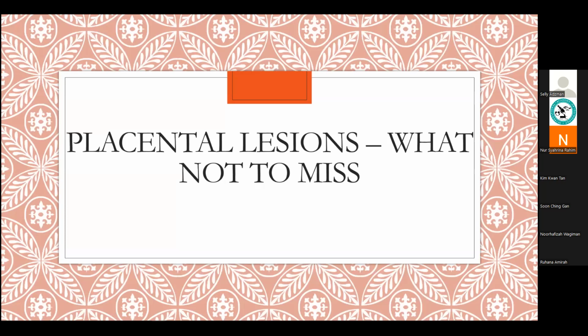I'm aware that not all hospitals practice sending all the placentas. So basically, what I'm presenting is probably the ideal practice in dealing with placental specimens. However, I will try to incorporate what we used to practice daily in Malaysia. Hopefully we will change to a better practice, submitting the whole placenta.